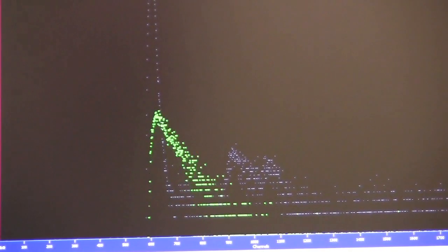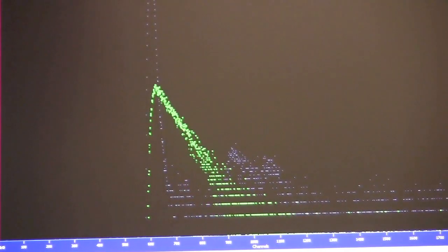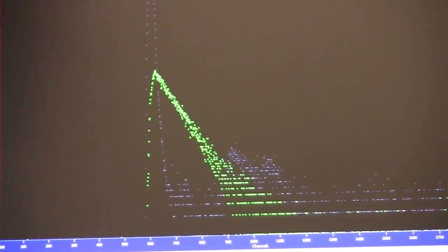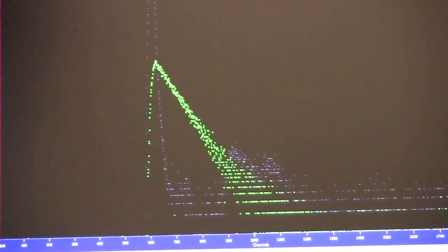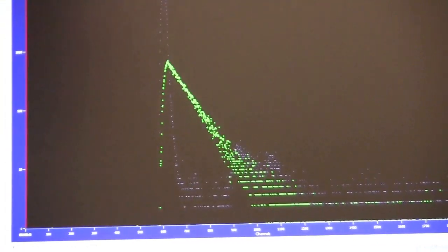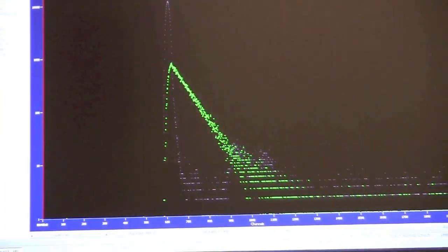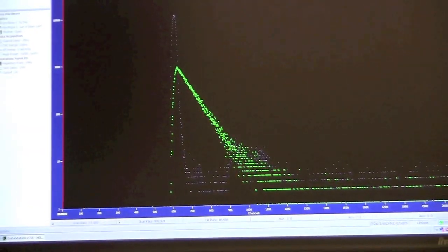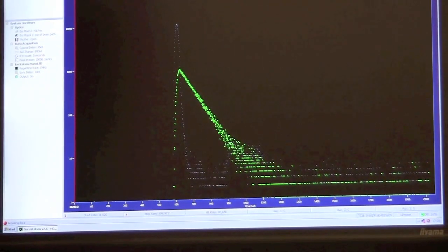Now we'll click on decay and record the actual lifetime of Alexa 488. Once again, when the highest count of the bins reaches 10,000, the experiment will stop and we can fit our data.